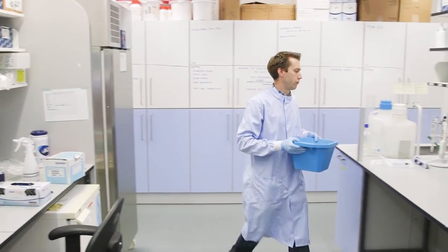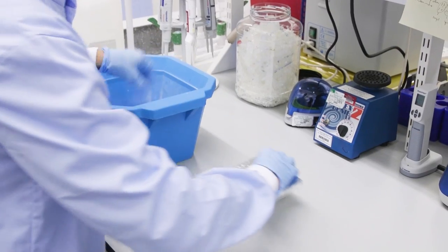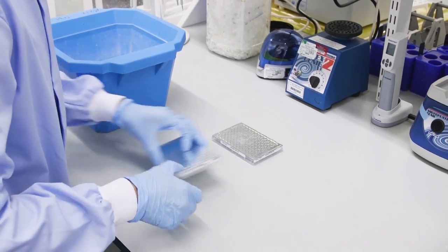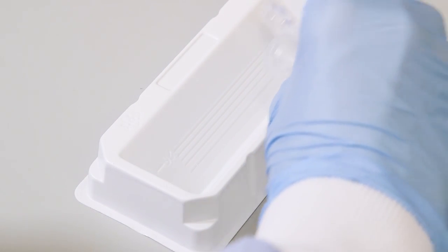Once we receive these custom-made oligonucleotides, the lab-based stage of the process begins. This has many steps and takes about two weeks.